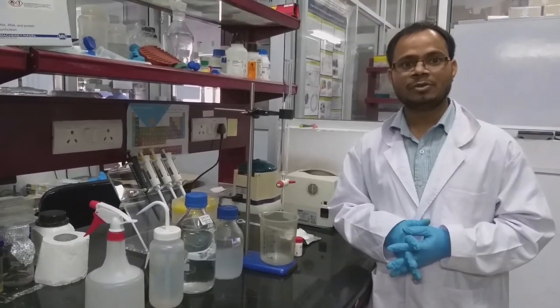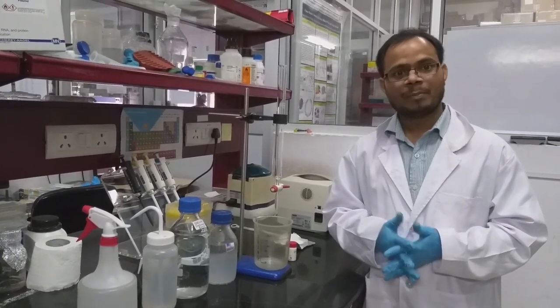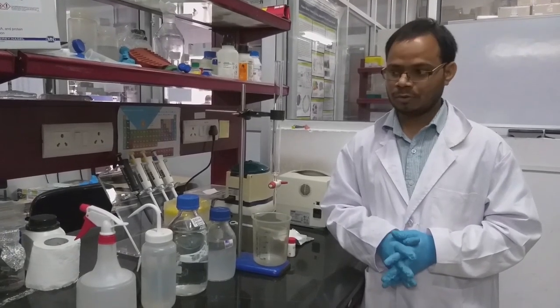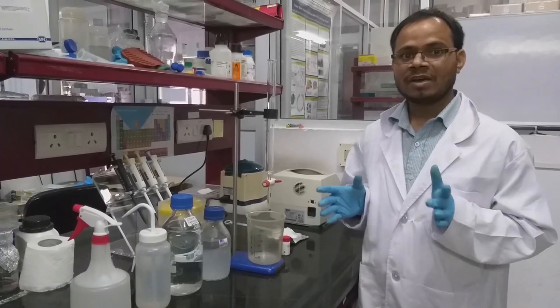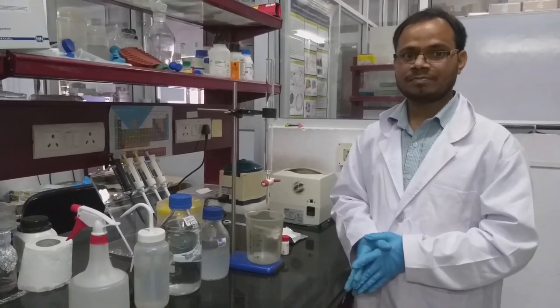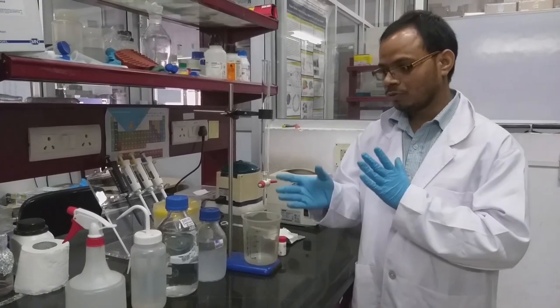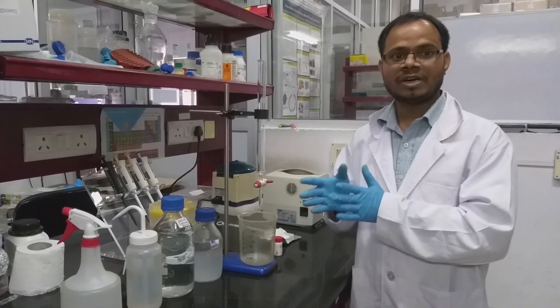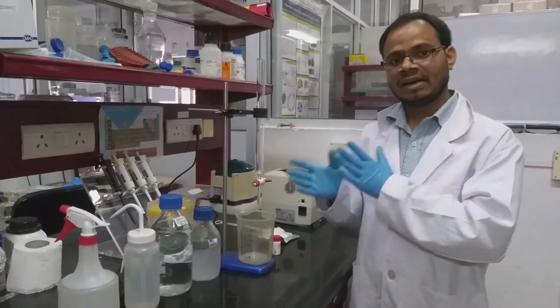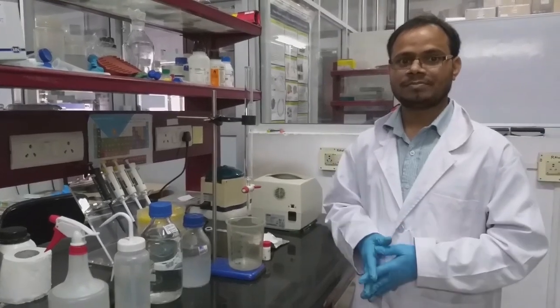It can be widely used for separation of proteins, peptides or oligonucleotides. In this video we will show you how to pack the column first, and what buffers are required, and we will demonstrate eluting two different molecules. One is of larger size and another one is of smaller size. So let's start the packing.